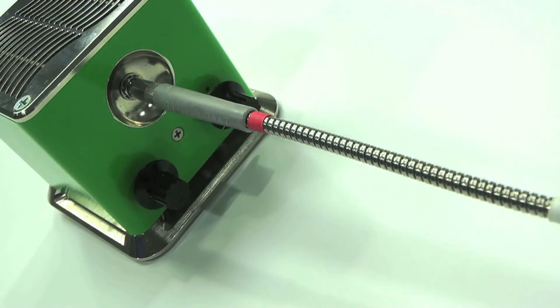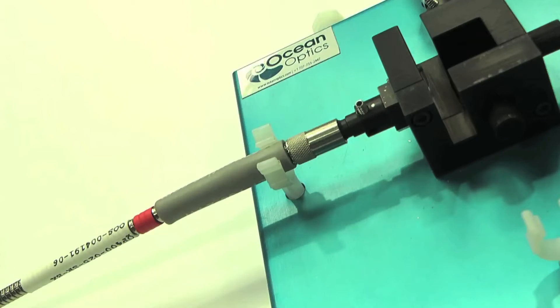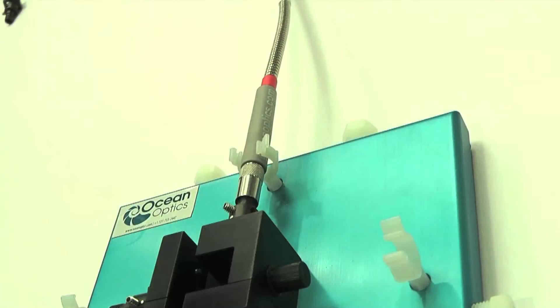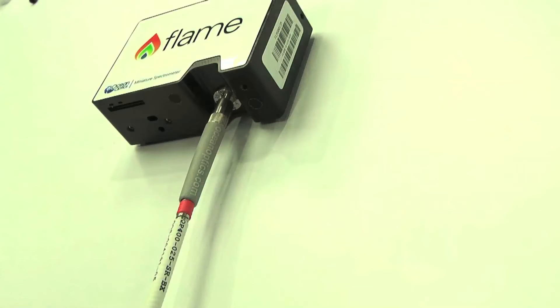To set up the instrumentation for fluorescence measurements, we simply connect one end of a patch cord to our light source and the other end to the sample holder. We then attach the other patch cord at 90 degrees to the first and the other end of that to the spectrometer.